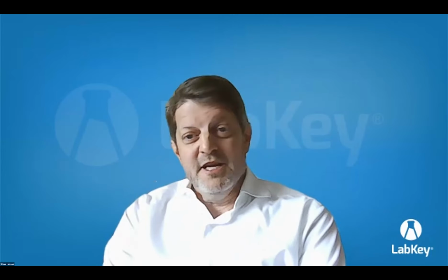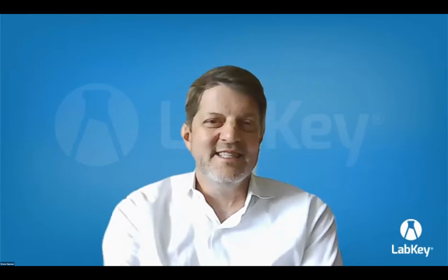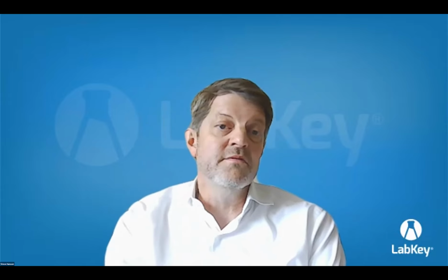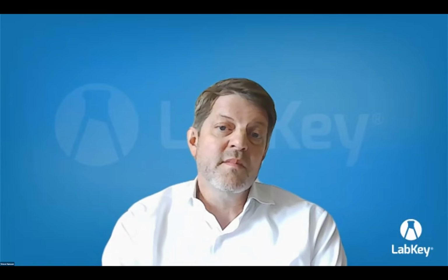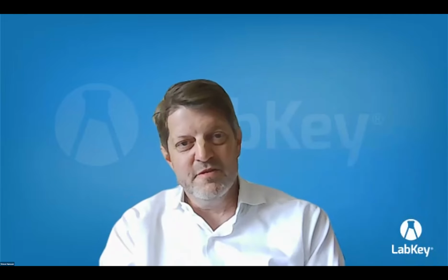Okay. So just for others, how can one interact with ChatGPT and LabKey SQL? Well, honestly, I've done a little bit with ChatGPT. It actually writes very effective LabKey SQL. I've been playing around with it and designing apps in LabKey. It's done very well. And I know, Joe, you've done some of that too. It's actually shocking how effective it is. I've asked it to design a survey that does this and that, and it just spit out perfect LabKey SQL for me.